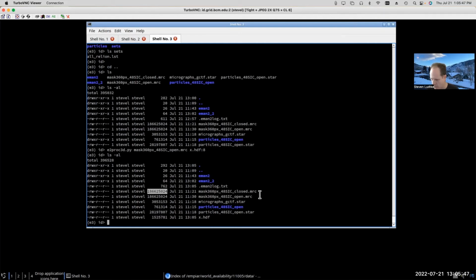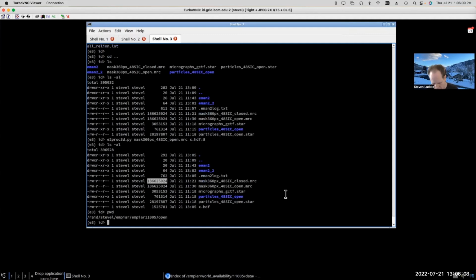So if you're trying to send final volumes that you got out of a reconstruction or something like that to someone else you want to look at, just converting it to HDF will generally save a tremendous amount of space. This isn't just masks that it's good for. You can also compress here. Let's take a look at a 3D refinement.